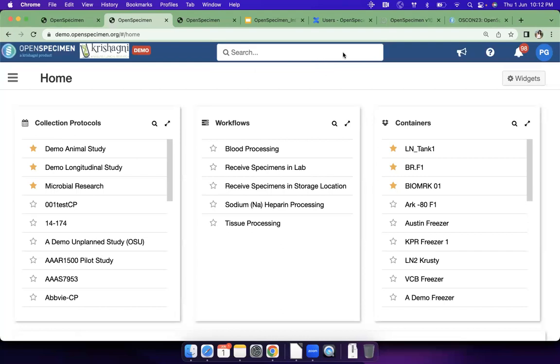I have a quick question for you. Yeah, sure. With the longitudinal study, the pre-entry, if the value is less than what we originally were thinking, so if I created aliquots, originally thinking 5 but actually created 4.